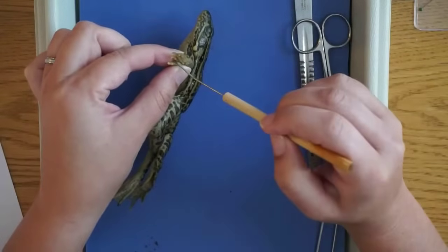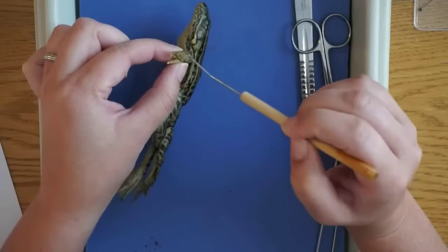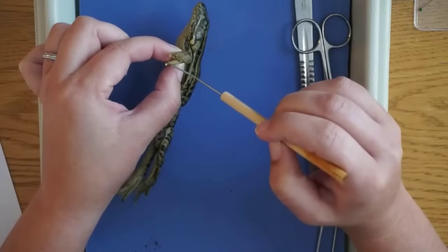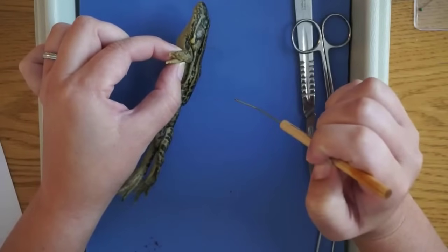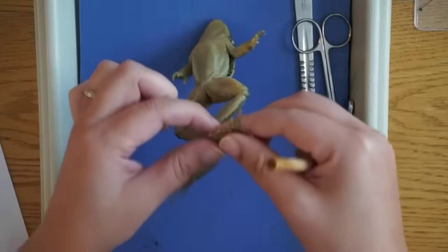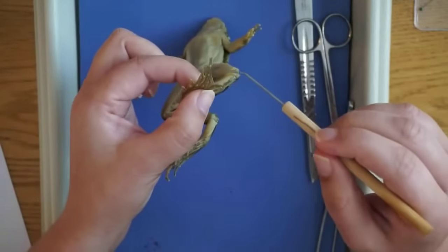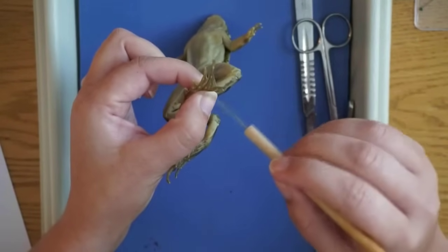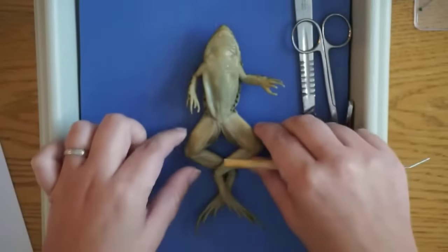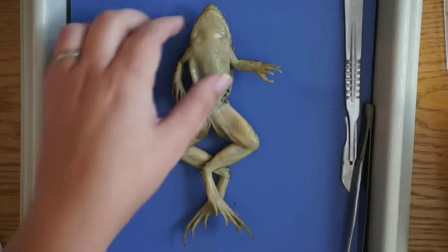If you take a look at the digits on the forearms — the toes — there are four, and then there's a thumb that's a little bit more powerful. That thumb is used for amplexus, for grasping the female. On the hind feet you can see there are one, two, three, four, five digits. So four on the forearms and five on the hind legs.